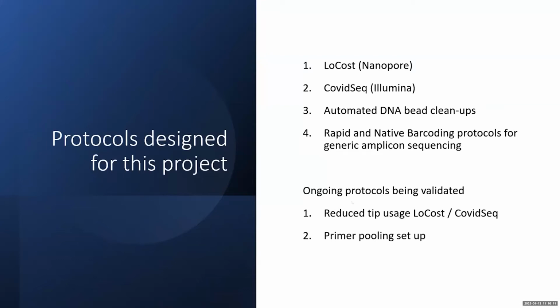And the other thing you can use it for is, if you're working on a primer scheme, such as the ARTIC one, as Josh mentioned, you can be working with 100 or up to 200 oligos if you count the forward and reverse primers. And when you are making this up, it can be quite a laborious task for one person to do. So if you use the robot and import an Excel sheet with all of the variables needed for all of the dilution factors, this is an option as well.